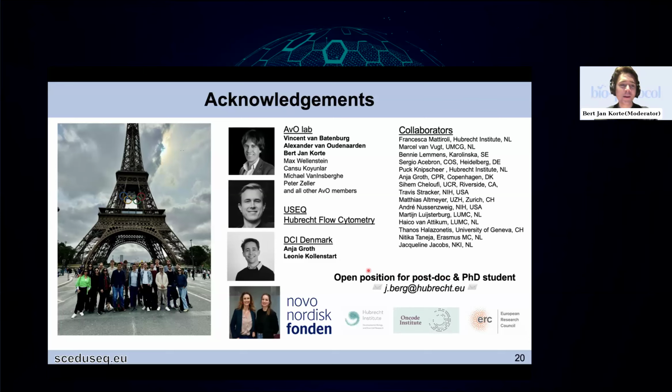Thank you for the talk, Jeroen. There have already been some questions coming in from the audience, so I'll start with that. Specifically, Tatiana asks, what percentage of forks travel uninterrupted for 75 minutes? And she or he has some follow-up questions: mostly for forks where the origins are closer, wouldn't they complete replication within the 75-minute time frame? And in these cases, how do you deal with this? Do you discard these areas where the origins are closer? Yeah.